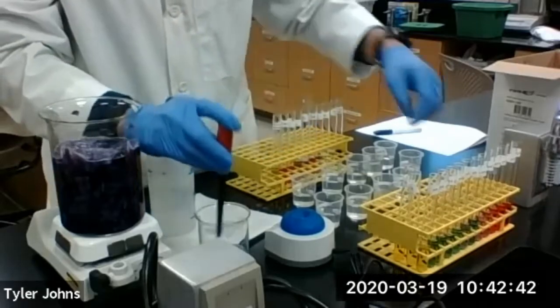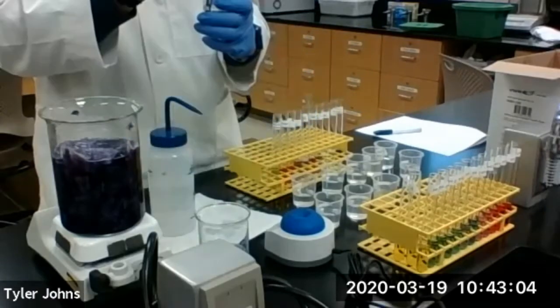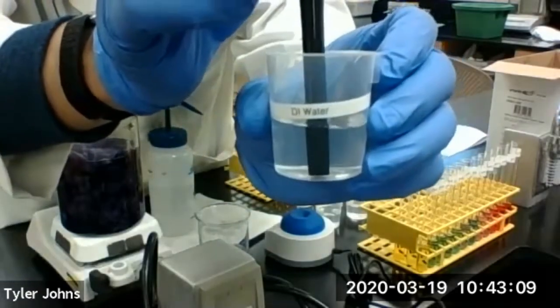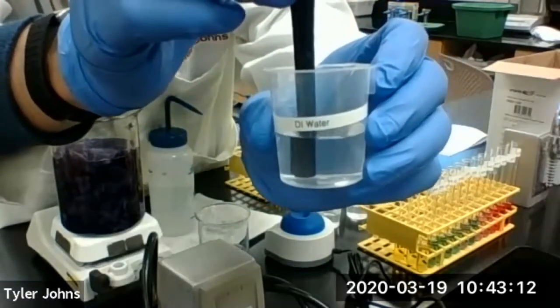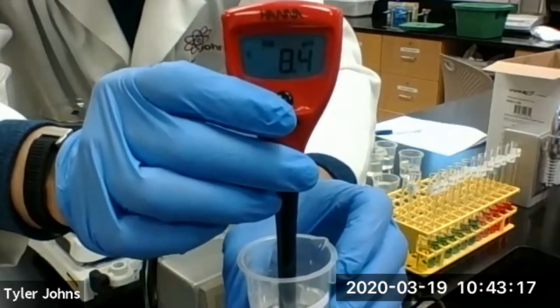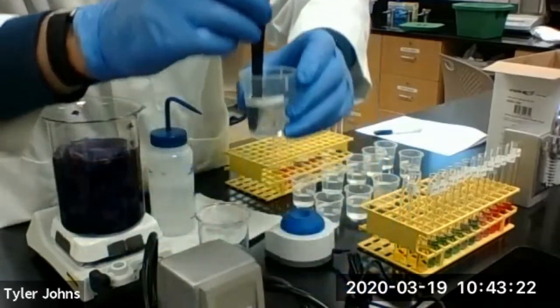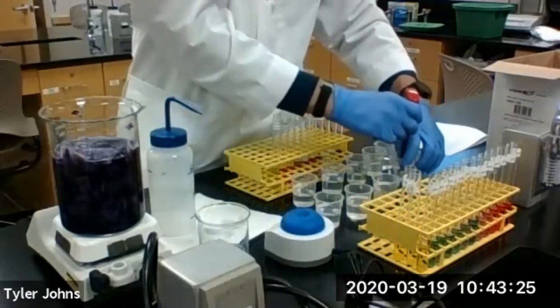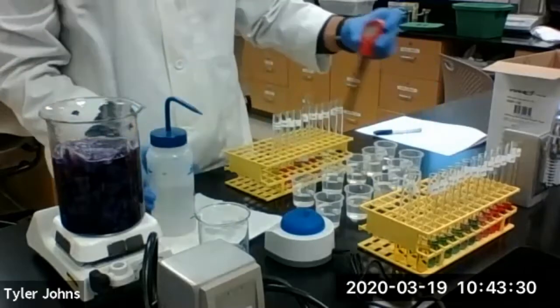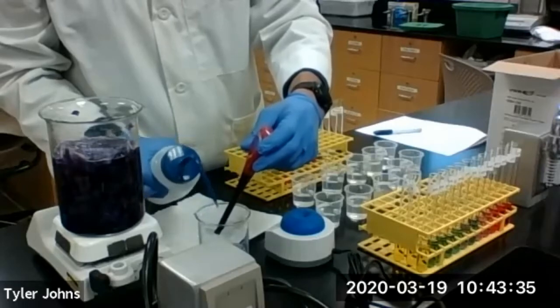Rinse our pH probe. And we'll move on to our deionized water. Now here's our deionized water, and our pH meter. Now the pH meter does not read deionized water very well because there's no ions in the water. And the pH probe uses that to actually measure the pH of a solution.